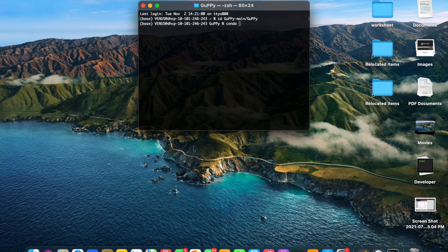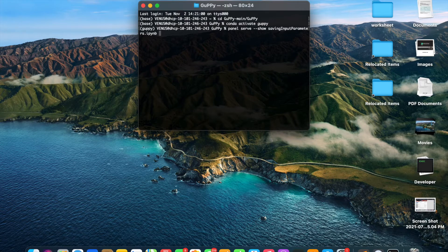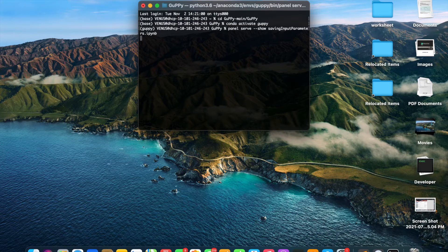After doing this, I will activate the environment which we created in the installation process using the command conda activate Guppy. After activating the environment, I will open Guppy using the command panel serve show saving input parameters. All these commands to open Guppy are available on the GitHub wiki page of the Guppy repository. When I execute this command, the Guppy home page will open up.